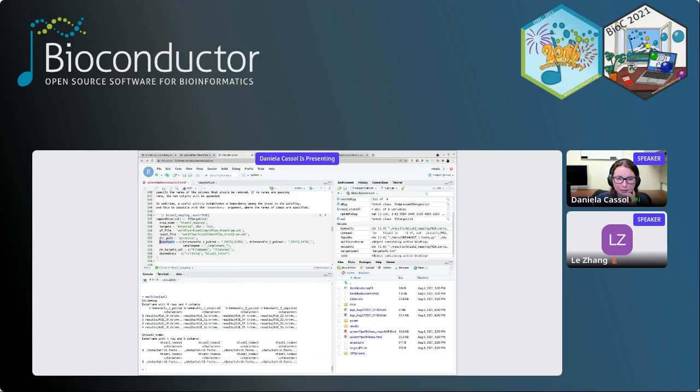So when I am specifying the input variables, now because I'm using the targets from this connectivity from the output files from the first step, now our name vector will be with the name of that particular column, that file you want to use to that column. So now I'm using here the trimmomatic one pair, and then again the same thing here, the variable we define in the input CWL file. So again, here is trimmomatic one paired, trimmomatic two pair, and all the variables we have defined in this input YAML. So here is actually where the magic is happening again, because we are making this connectivity not just, in this case, double, between the targets file and the input file from CWL, but also with another step, a previous step, which is the trimming.